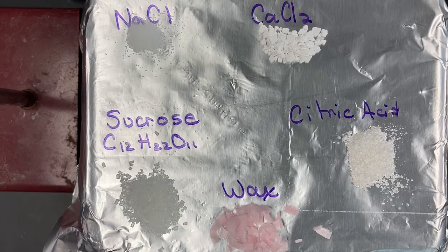And your job. Okay, the first thing that we want you to do in your data table, which you should have open in front of you, is fill out the physical description for each of these substances. What do you think they look like? Just a few observations. There's not a ton up in a room, but jot down the best physical description that you can for these. And then we give them time.